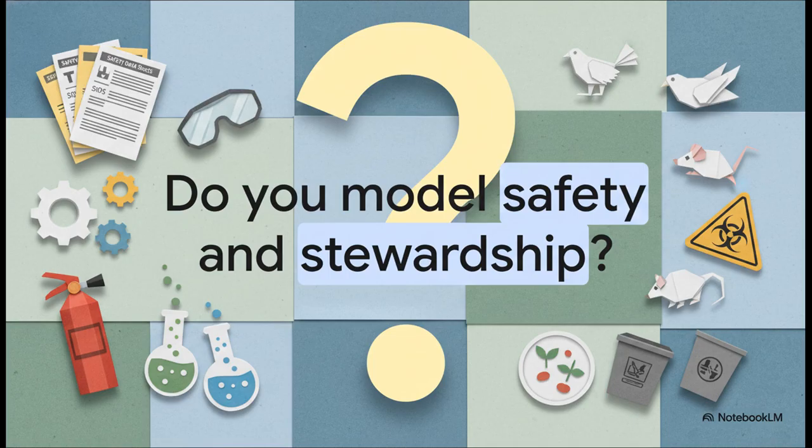All right, we have covered a lot of ground today. We've talked about the critical everyday necessity of the SDS, the rigid protocols for storing equipment and chemicals, the profound ethical requirements of organism care, and those absolute, non-negotiable rules for disposal. It is a massive, massive responsibility to balance managing inanimate hazards while being a living steward. So I want to leave you with this thought to evaluate your own workspace. When the bell rings, will your daily lab practices hold up as the ultimate model of both rigorous safety and ethical stewardship? Thank you so much for watching this explainer, and keep learning.